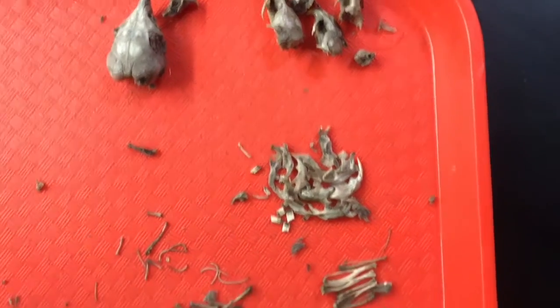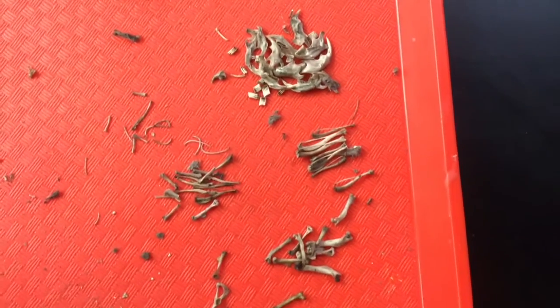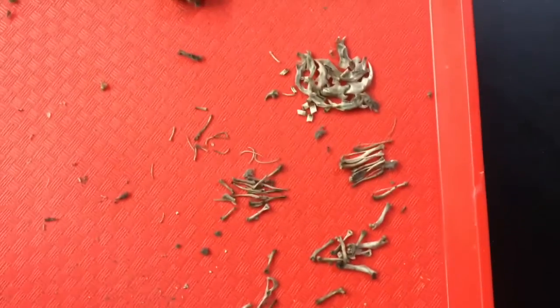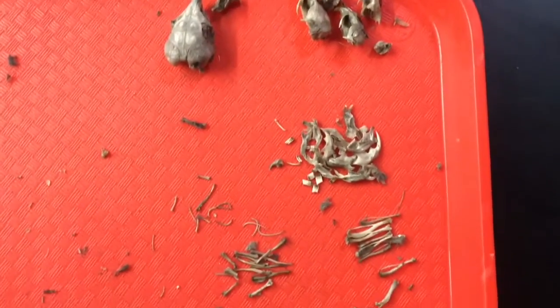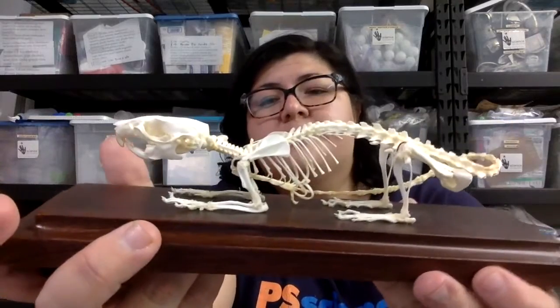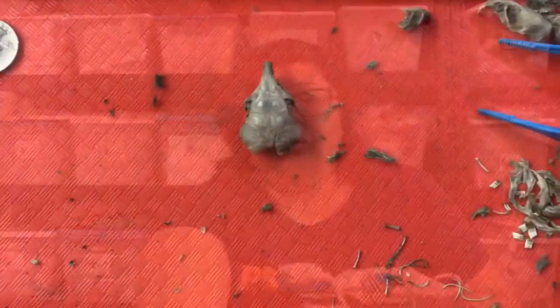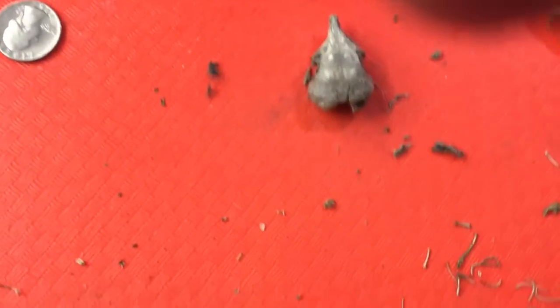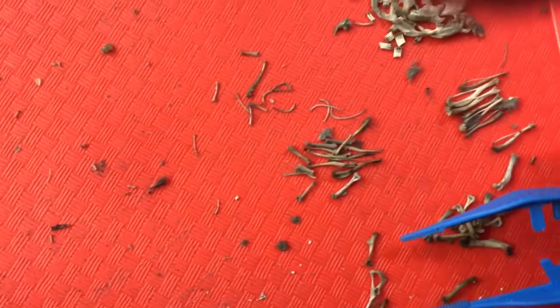I've got my skull pile, my jaw pile, my other bubbly bit bone piles. And now I guess it's like a puzzle. I need to put all of these things together. But how? Our bones are held together with ligaments and joints. This rat skeleton is held together with glue and wire. So I don't know if our bones are going to be able to be reconstructed to stand up, but we can at least lay them out the way that they should go. We know the skull goes up the top, but what about the rest of it?